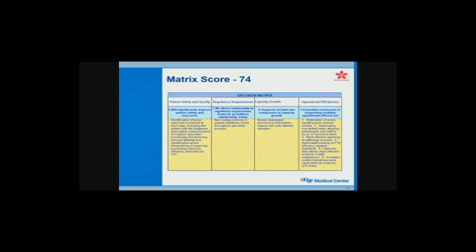So we went and filled this out, talking about how we would identify every step along the way: positive identification, positive handoffs to every section, and being able to retrieve specimens when we need to, knowing where they are at all times, all that sort of thing. And the side benefit was that we expected it to improve turnaround time.